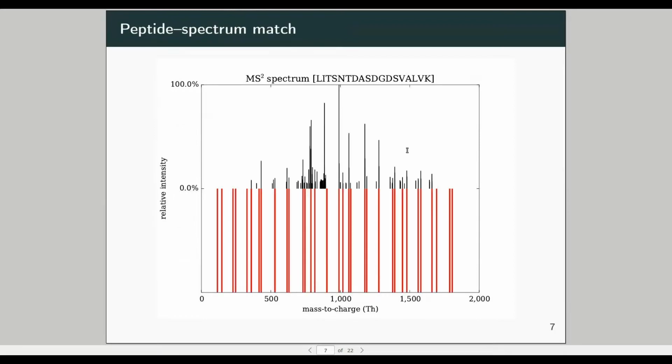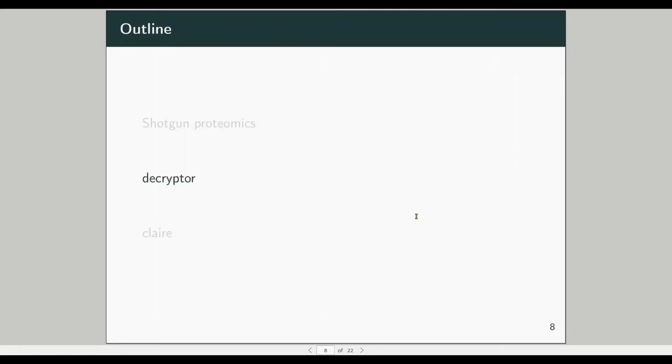which is usually done in such a way that you have either a set of candidate peptides. Here the database can be actually quite large, or there are many other ways how you can do it. But what's going on is that you predict how the spectrum should look like, and then you evaluate its match. Yeah. And once you get the peptides identified, then you detect the proteins, or basically you infer the proteins from the detected peptides.